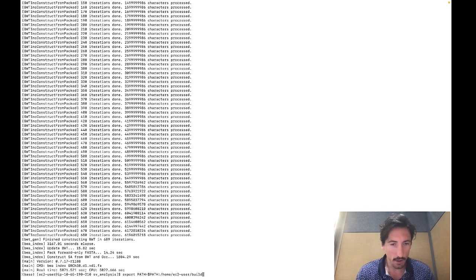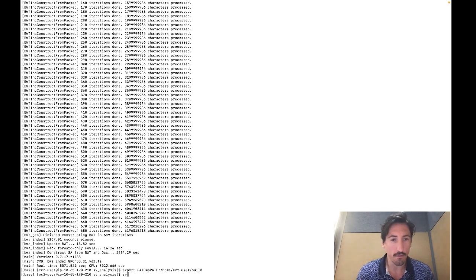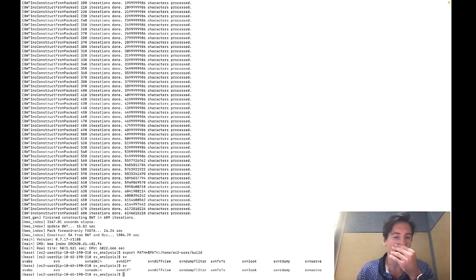We'll do build. That is the path, I believe. Let's see if we have. Okay, so SvABA is now in our path, so we can directly call it. And so now that we have our reference, we can just run SvABA. The command is relatively simple. Just call SvABA, you want run.